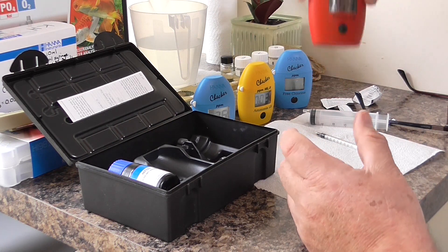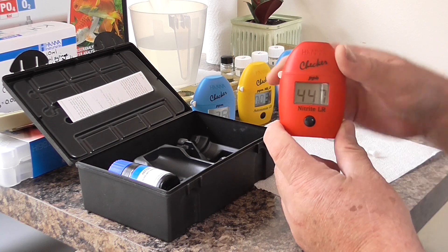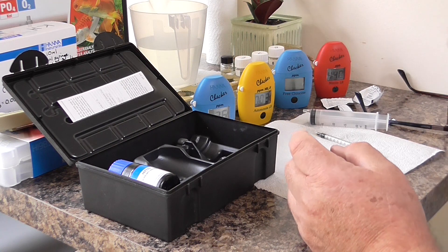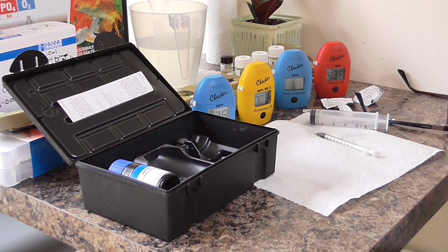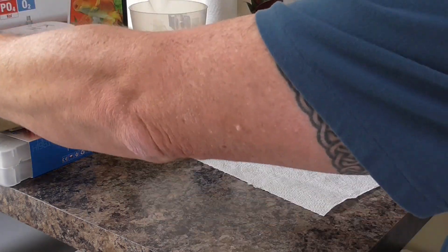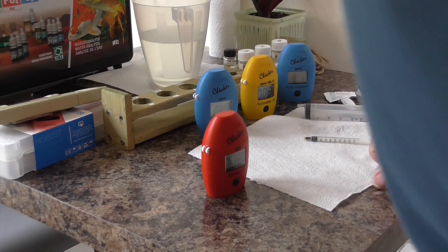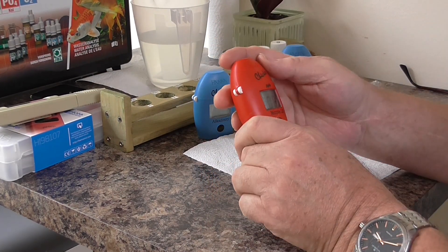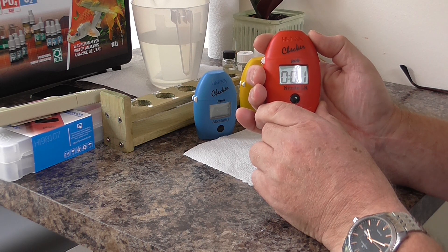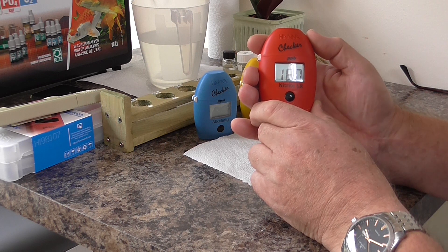Which just leaves the nitrite, which as you can see still has just about five minutes to go. We'll put that down and check again once the timer comes down. 7, 6, 5, 4, 3, 2, 1 — it's calculating for nitrite. Nitrite comes in at 160, and I'll explain that to you in a moment.